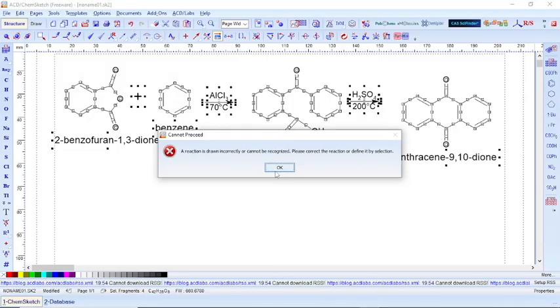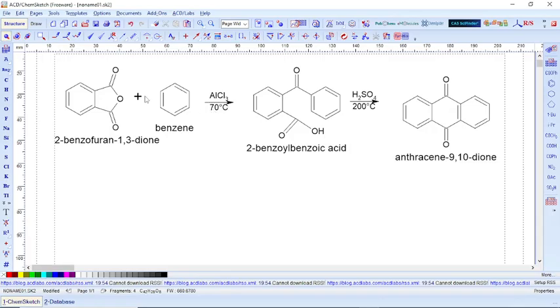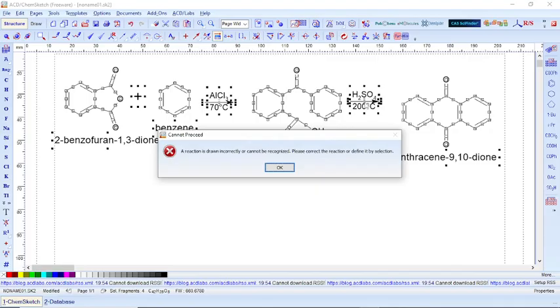Even if I come to this point and click here, if I come to this point and click at this point, it will still give the same message, that it cannot understand the reaction here.